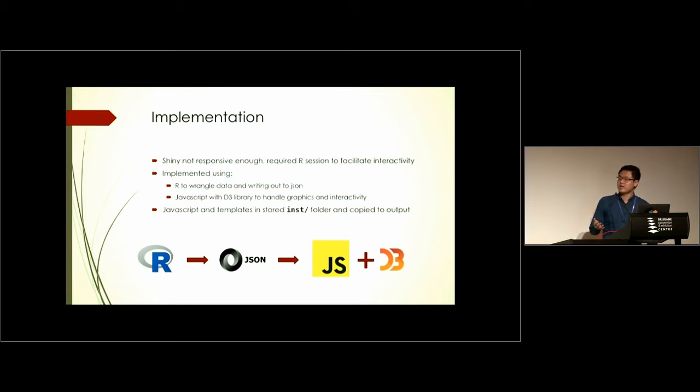It's compatible with several objects from the limma and edgeR packages for RNA-seq analysis. There's also limited DESeq support. I don't personally use that package, so it may be a bit buggy around the edges, but I have tested basic cases. Once you do that kind of analysis, you can take the results that come out the end, put them into Glimma, and it will show you some nice plots.